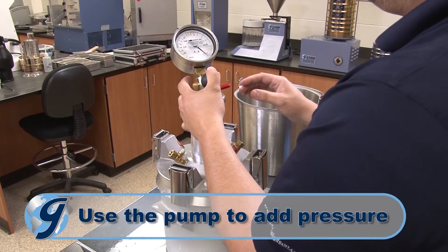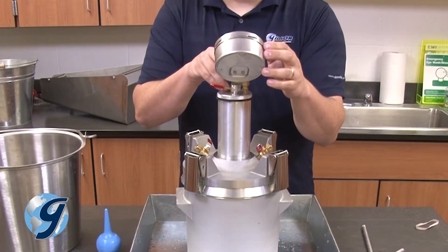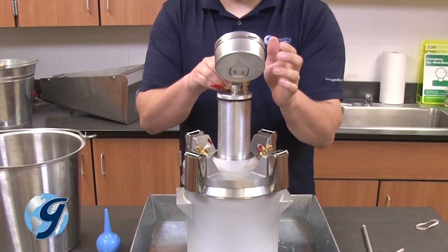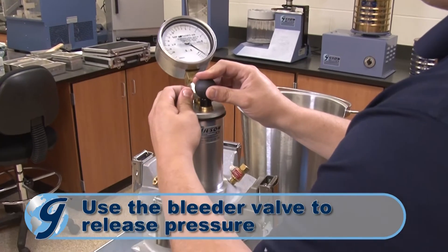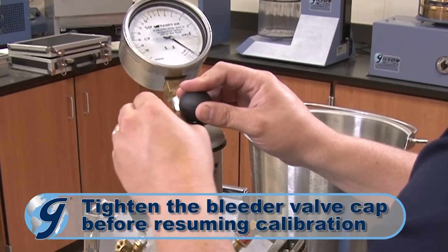Next, make small adjustments to assure that the needle is aligned to the proper initial pressure mark by lightly tapping the gauge body to stabilize the needle. If too much air is pumped into the meter, loosen the air bleeder valve cap to reduce pressure. Be sure to tighten the valve cap before resuming.